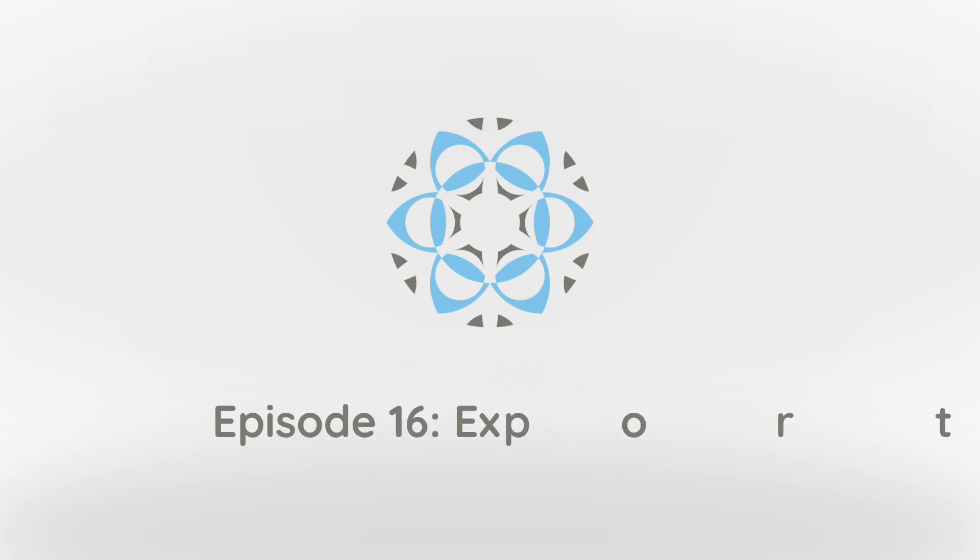With the latest version of Profex, which is version 4.2.4 at the time I'm recording this, we can export refinement results directly to Excel.